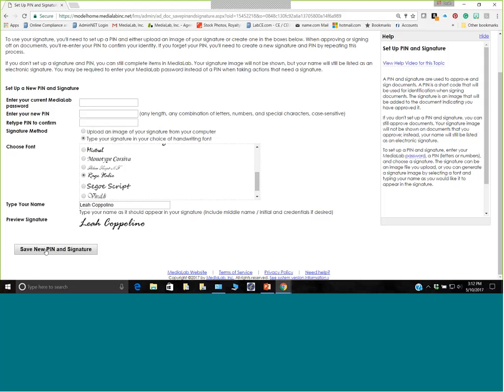So at this point, my signature as an admin or an approver would be placed on the cover sheets that MediaLab makes for your documents. We do that automatically for every document that you give us, and it really looks very well organized. All of the signatures are easily displayed on those cover sheets at inspection time if you need to show printed copies.